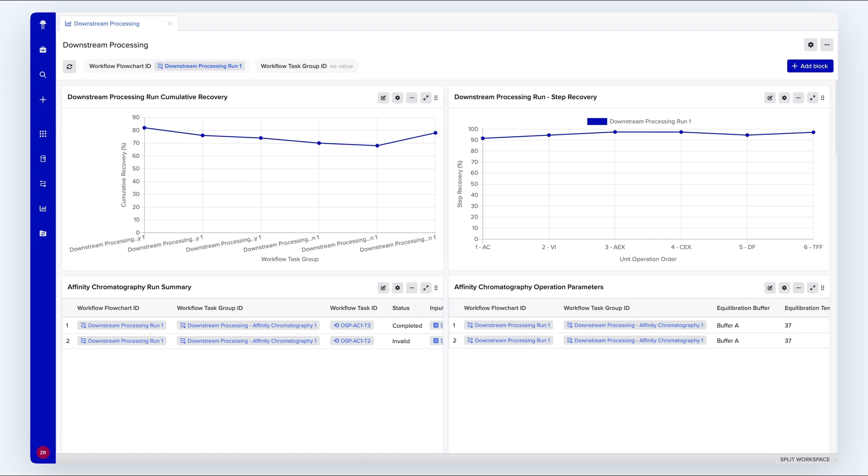Here's an example of a dashboard showing results from antibody purification. This dashboard is collating information across multiple experiments done by different teams and does not require any manual effort to pull data from individual entries.